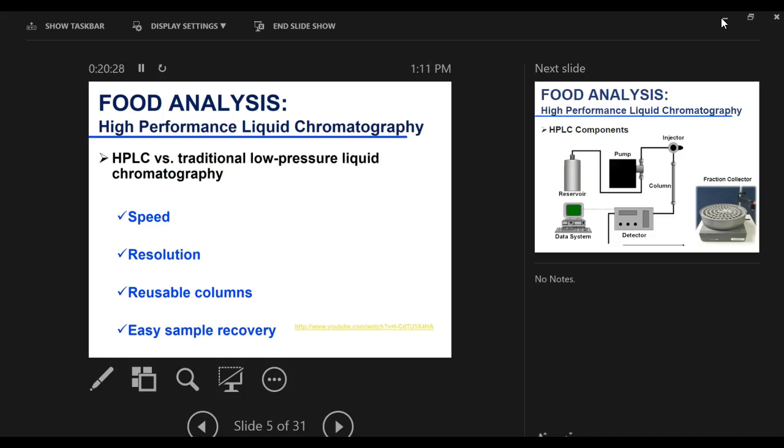So what happens during an analysis? The mobile phase is flowing through the system from the mobile phase reservoir to waste. We will inject a mixture of 3 components, shown here using 3 colours: pink, green and blue. At the head of the column, when the sample first encounters the stationary phase, we have a mixture of all 3 components. The equilibrium between each component, the stationary phase and the mobile phase is different for the 3 colours in the mixture. In our mixture, the pink component spends more time in the mobile phase relative to the green and the blue and travels through the column quickest.